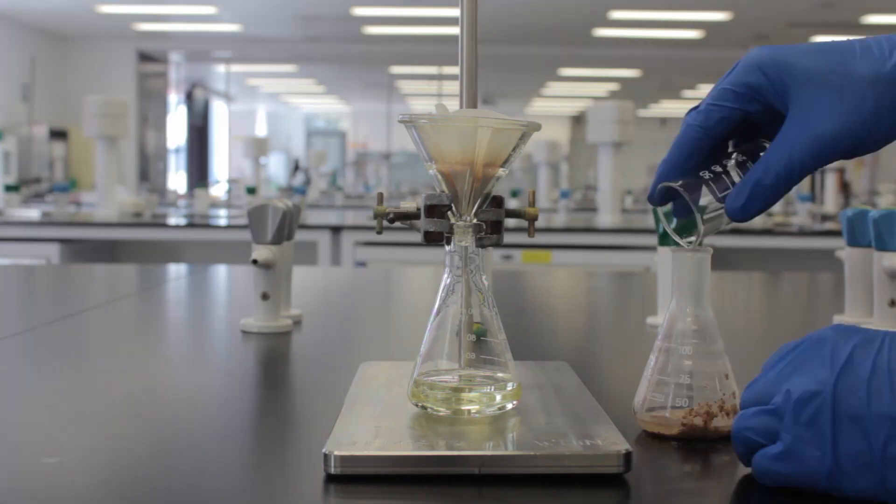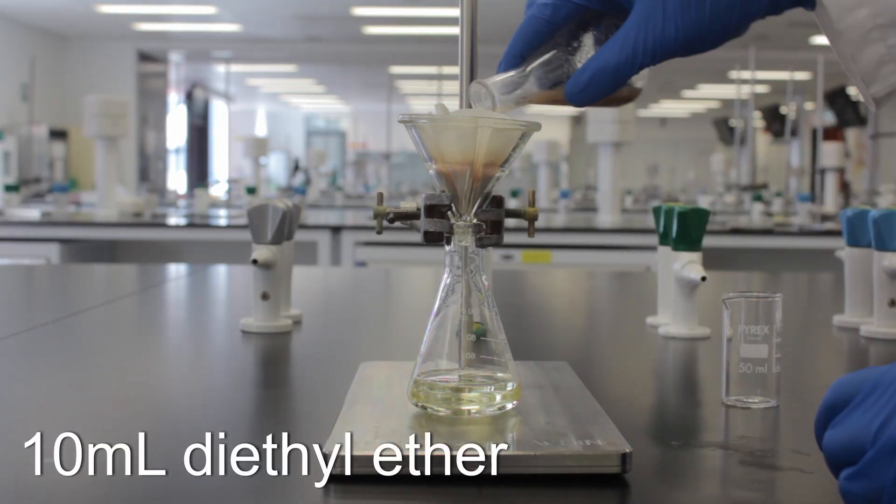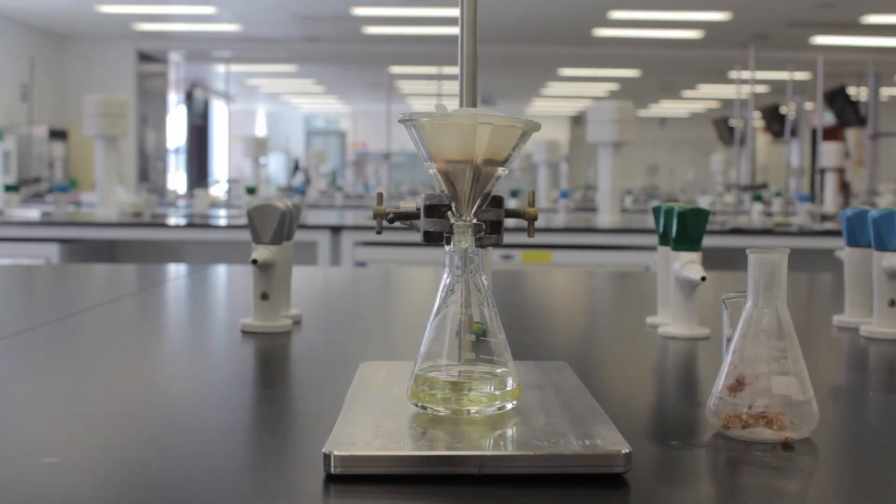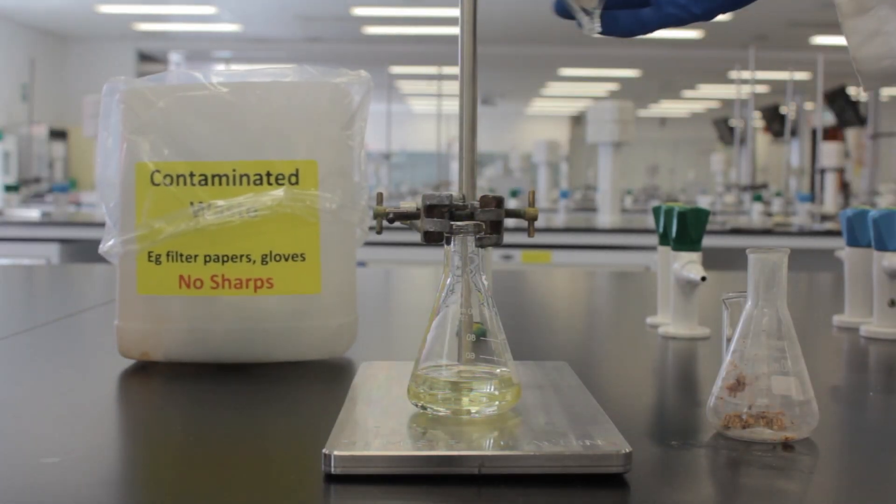Wash the flask with 10 ml of diethyl ether to wash out any leftover product. When it's done dripping, discard the gunk in the contaminated waste container.